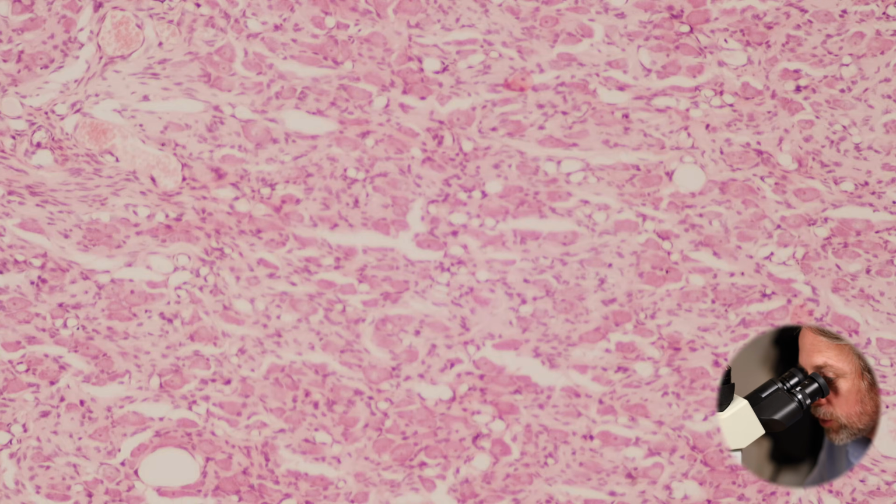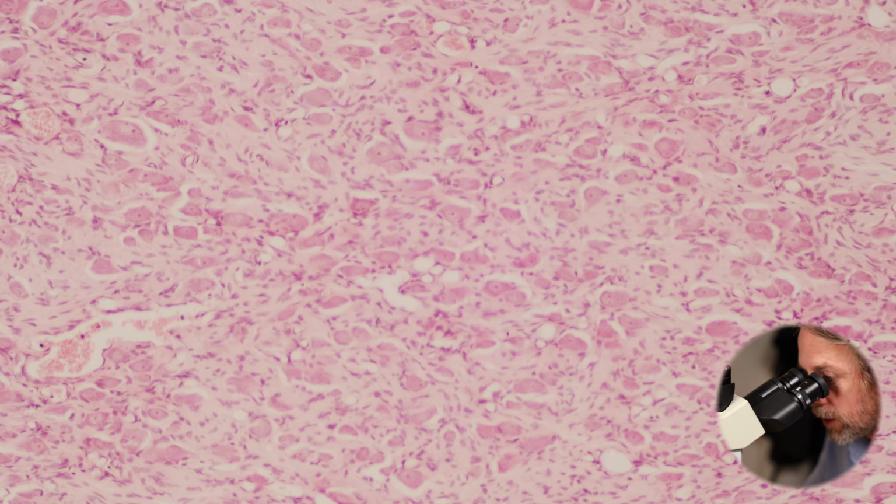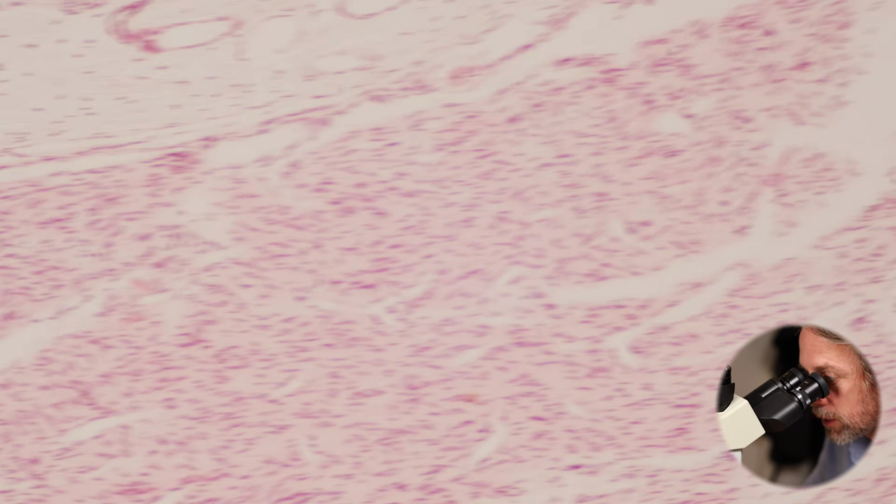And in the peripheral nervous system, we saw those axons surrounded by Schwann cells and other supportive cells, all bundled together with connective tissue. And that's what gives us a mixed nerve, a nerve doing lots of different jobs, running off to whatever part of the body needs those jobs doing.